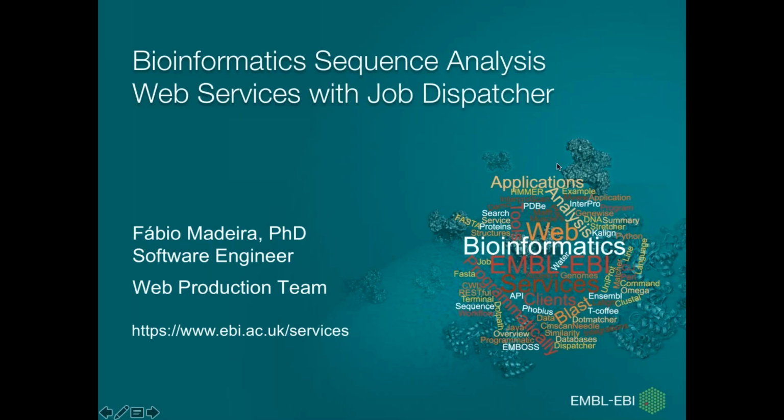So welcome everyone, I'm Fabio. Today's webinar, as Andrew said, is about bioinformatics sequence analysis web services. And in this case, I'm particularly describing the Job Dispatcher framework.